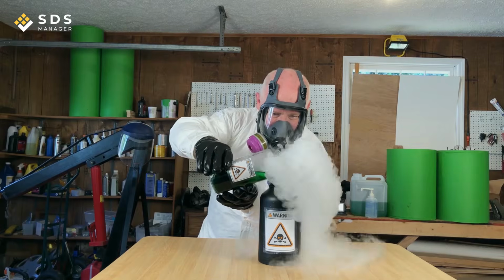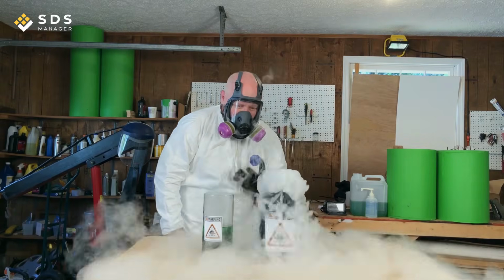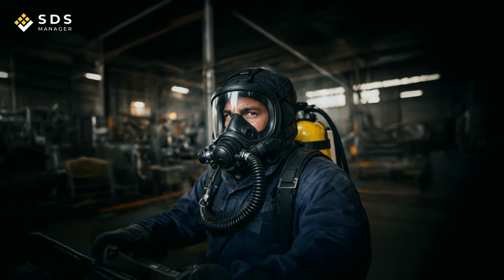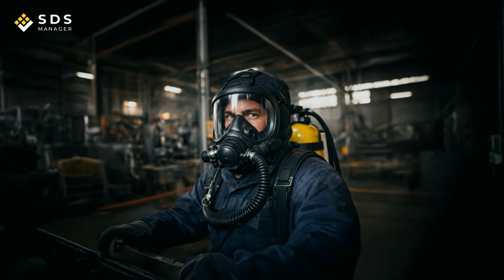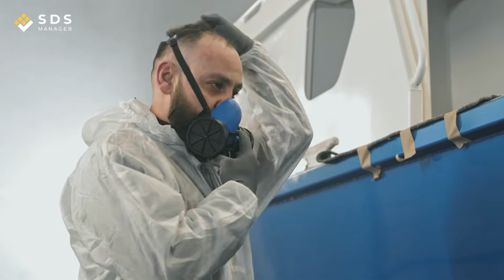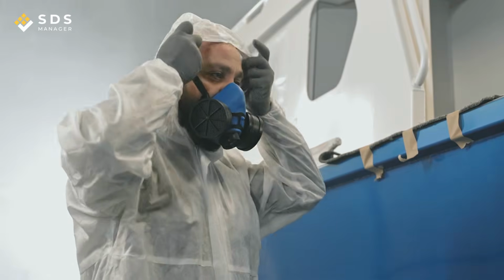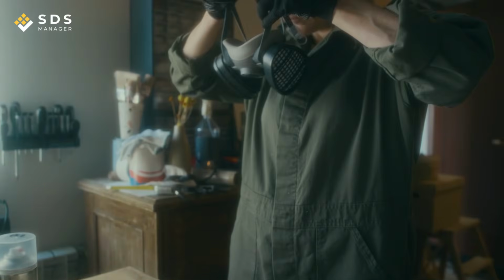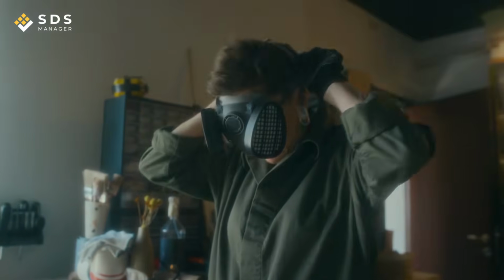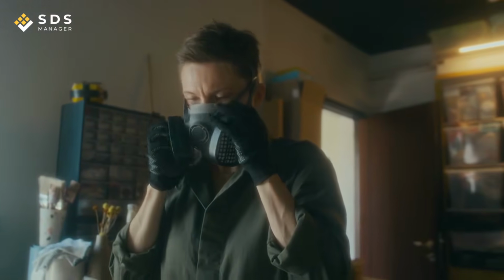Full-face respirators extend that protection to the eyes and are used where concentrations are higher. Supplied air respirators are reserved for environments where oxygen may be depleted or concentrations are immediately dangerous. A critical point to remember is that respiratory protection only works when it fits correctly. Fit testing is a regulatory requirement in many jurisdictions and must be completed before a respirator is put into service.